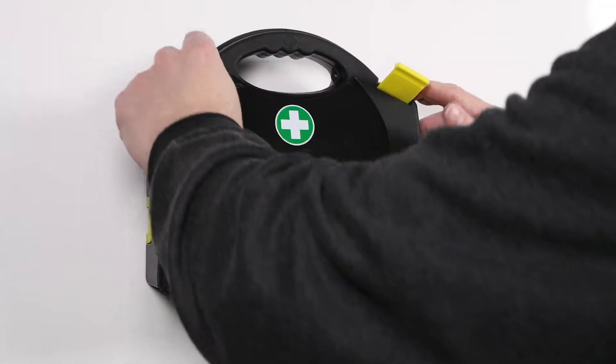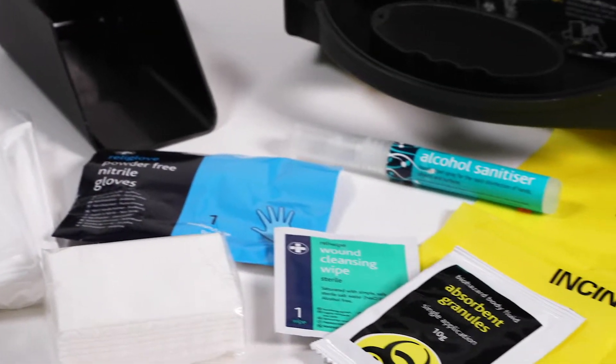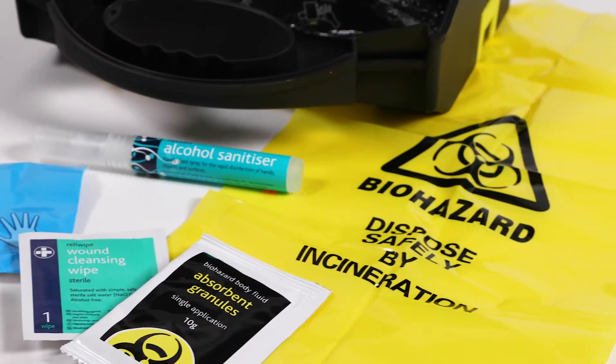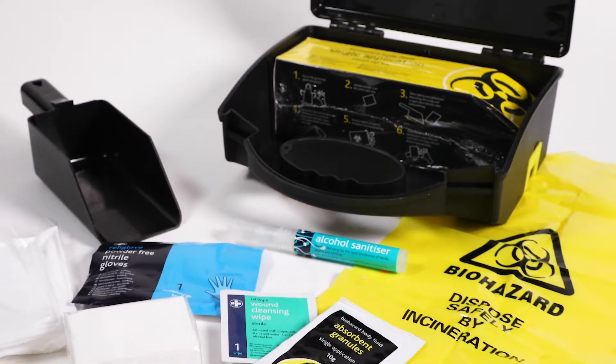Each application is packaged separately for convenience, and guidance for each application is displayed on each individual box. The kit helps disinfect soiled areas and reduce the risk of contamination.